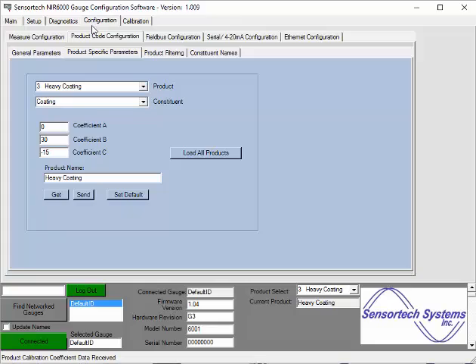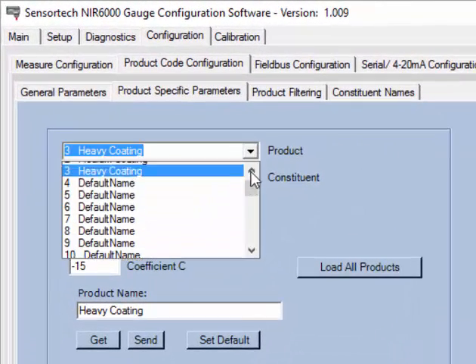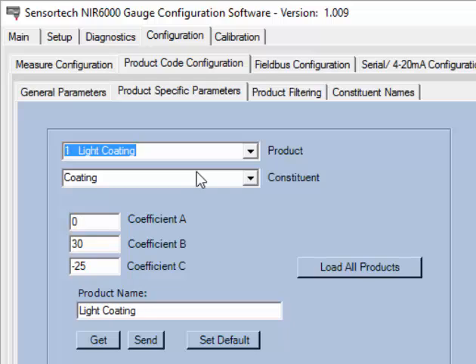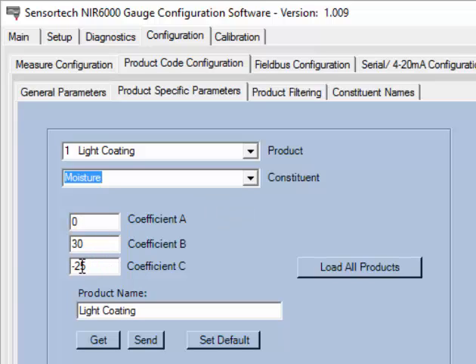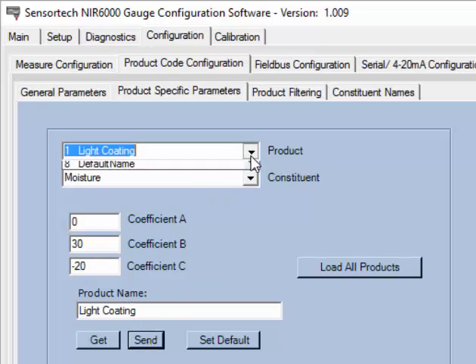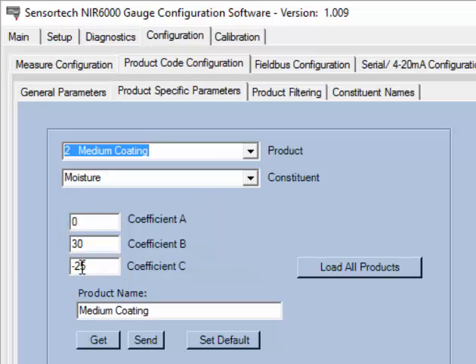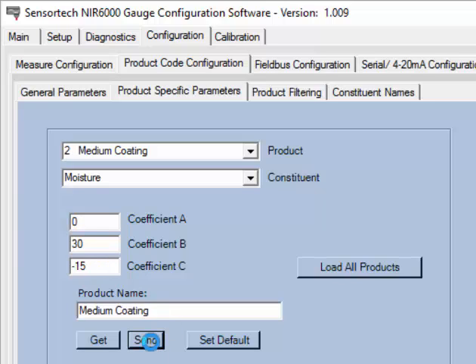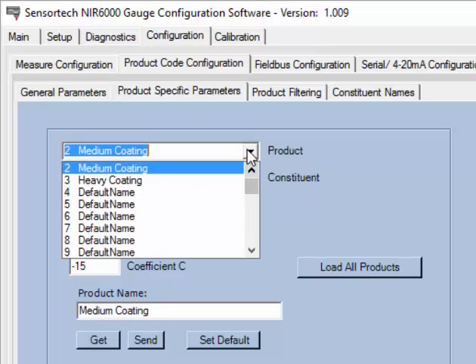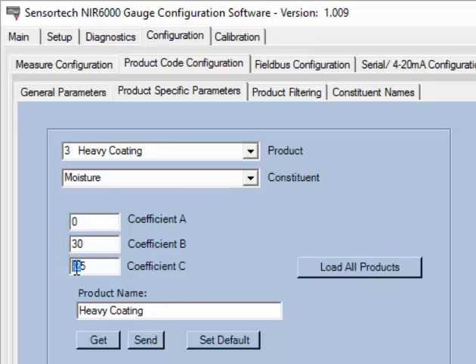Moving back to the product specific parameters, we will change the moisture calibration to demonstrate the ability to calibrate the moisture constituent by selecting the constituent drop-down menu. Changing the constituent drop-down menu to moisture will allow you to set the calibration for moisture in the light coating product or calibration code. Selecting medium coating will allow you to change the moisture calibration for that product or calibration code. We do the same for the heavy coating product or calibration code.